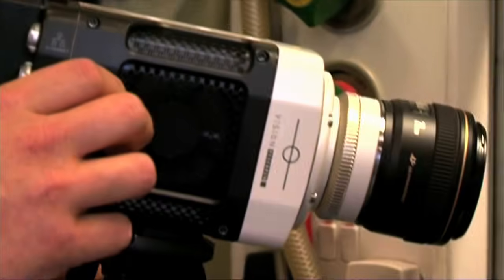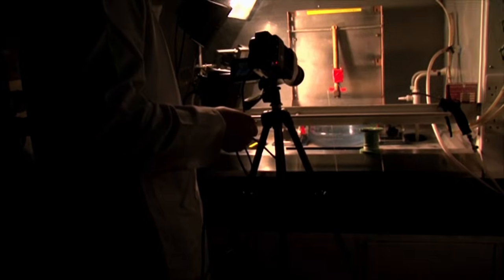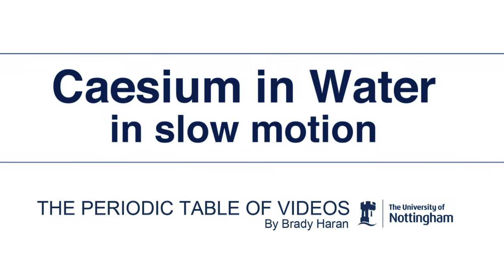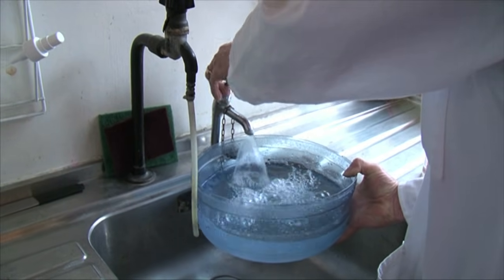We decided to try a quick experiment to see caesium reacting with water using a high-speed camera. This is just a quick demonstration to see what happens.